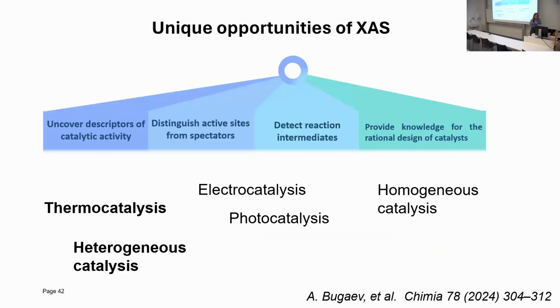Okay, so just to summarize, let's say, what the unique opportunities of XAS for catalysis are. I was trying to show you that we could really find the descriptors of catalytic activity, distinguish active species from spectators, but also really detect reaction intermediates, and ultimately understand and rationally design the catalytic materials.